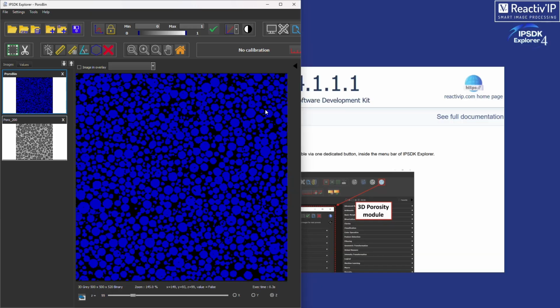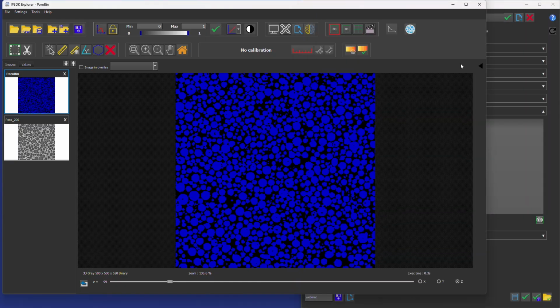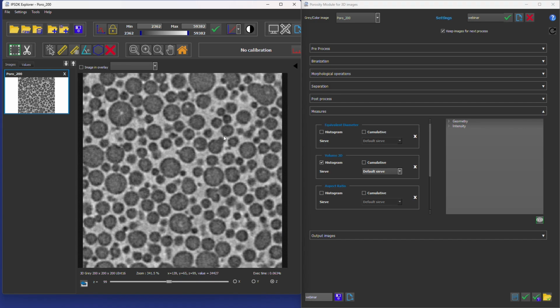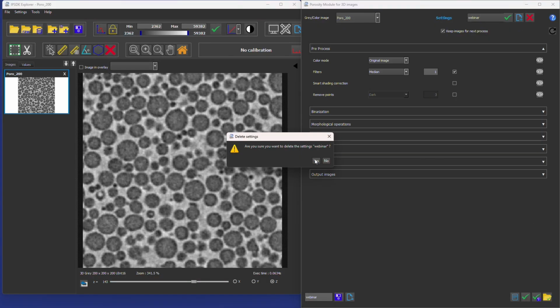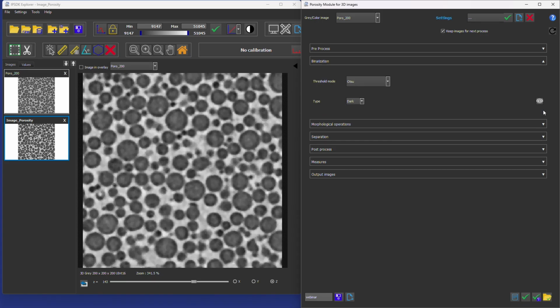You can get your data set, which is a 3D data set. You can move through the different slices. And if I go, just clean a little, you can just say, okay, maybe I want to make some filtering. Okay, I can apply it, and you can see every time I click on the icon, you will see a refresh here, and you will see the different steps.